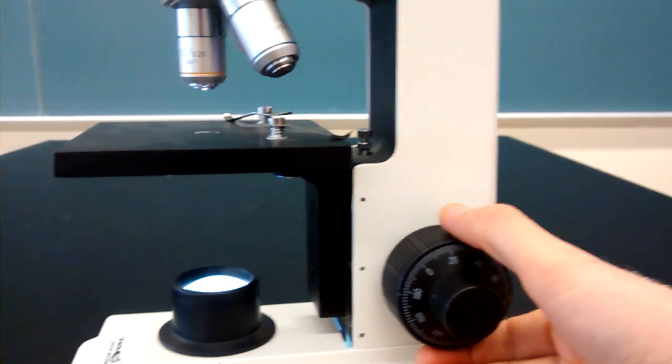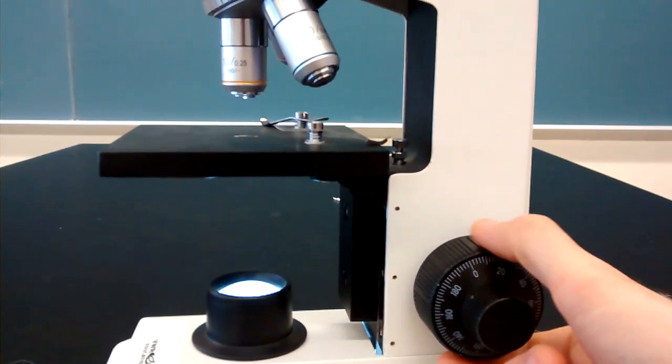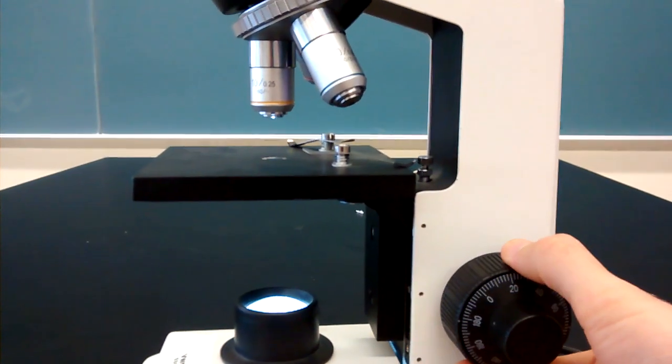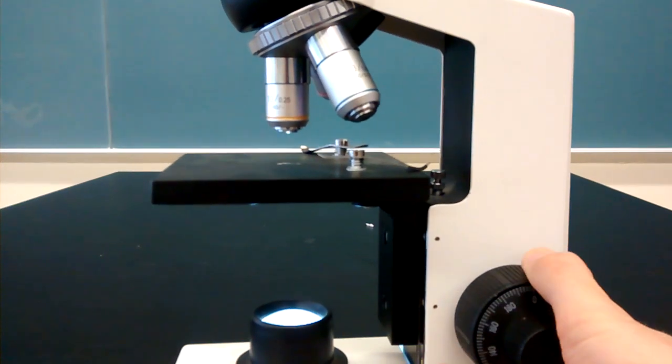Finally, we have these knobs. The larger knob, sometimes this is a separate knob, sometimes it's the outer knob. This is called the coarse adjustment knob. And as you can see, that causes the stage to move up and down.